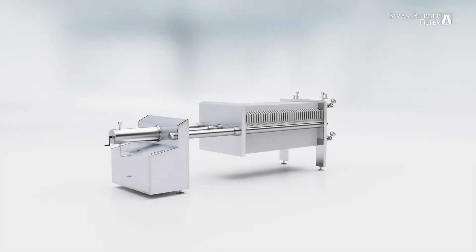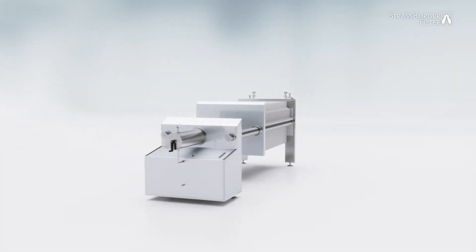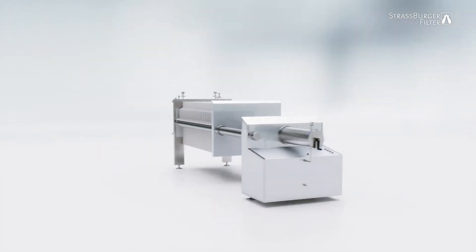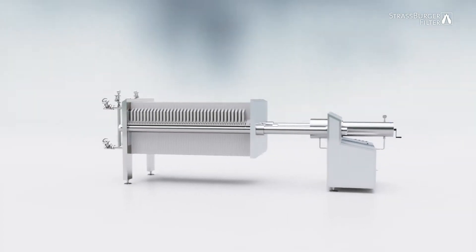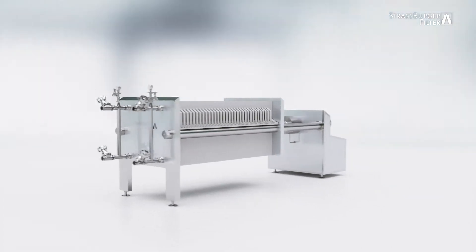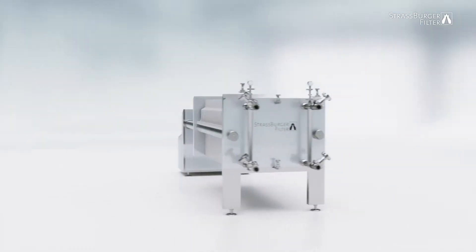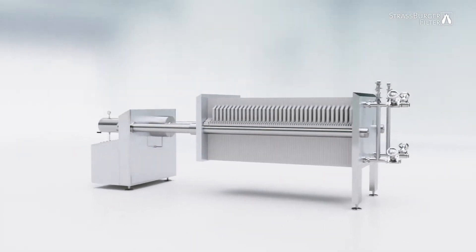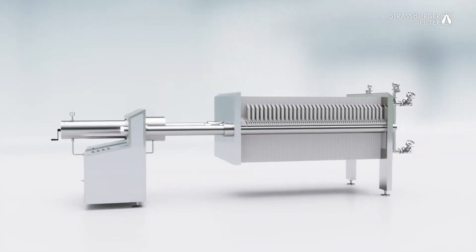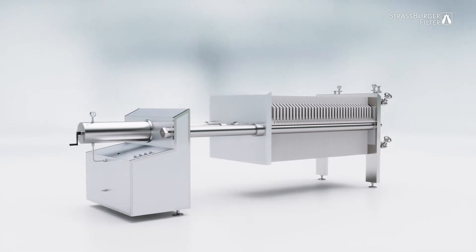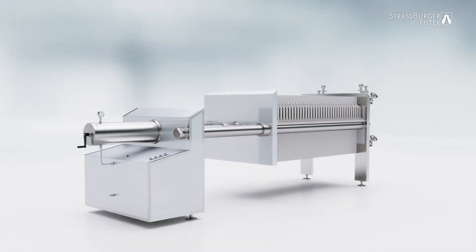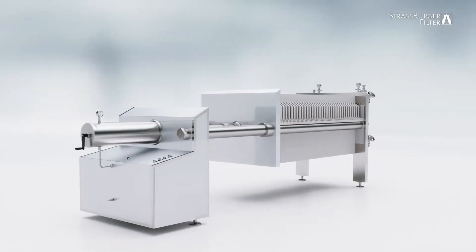Hermetics was specially designed to meet the unique requirements of the pharmaceutical industry. Its design, select materials and available surface qualities meet the highest hygiene requirements.